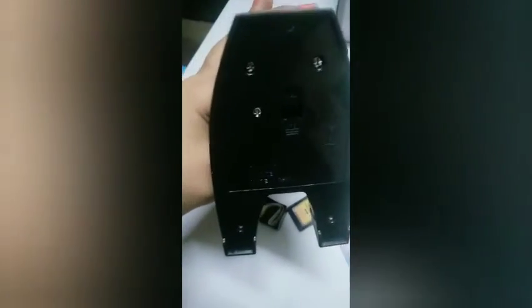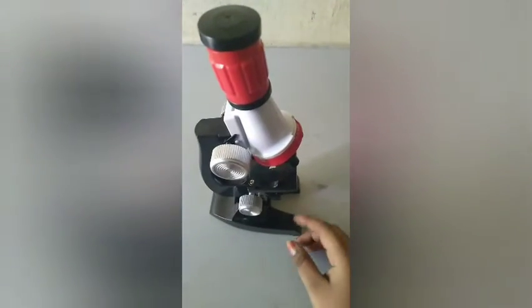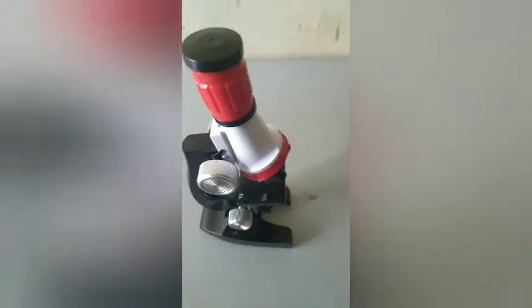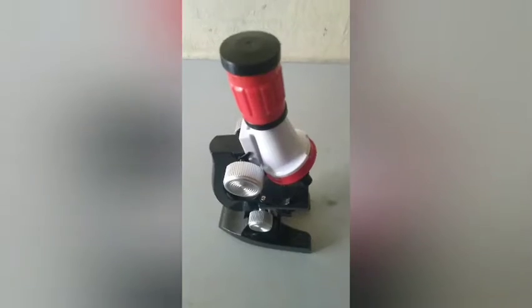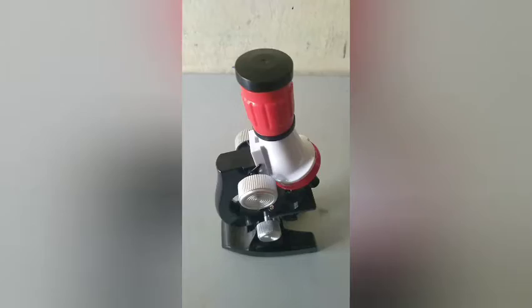At the bottom we have the place where we can put the battery and we have to open it using a screwdriver. I will get that screw. Okay, now I have inserted the batteries. We have to insert two batteries for this microscope.